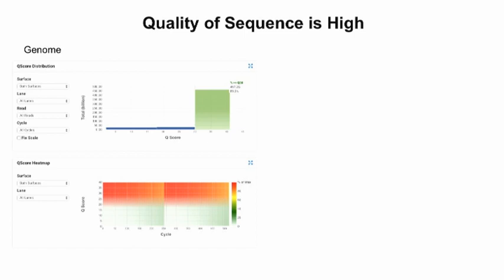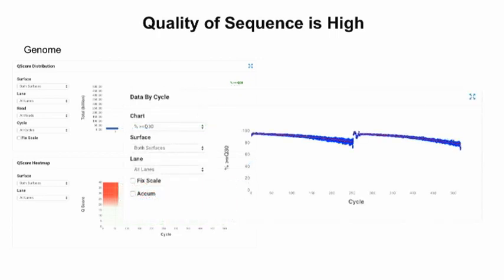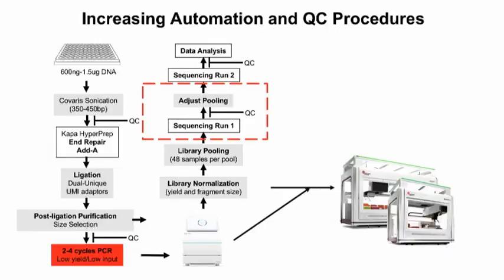So in that spirit, again, sequencing quality remains pretty high on the genomes. We're seeing easily into the 90s, mid 90% at Q30. And you can just see that slight drop off at the end. But again, since you're doing the head to tail, the low quality lines up with high quality on the other side, so it works out pretty well. And this is another example there.